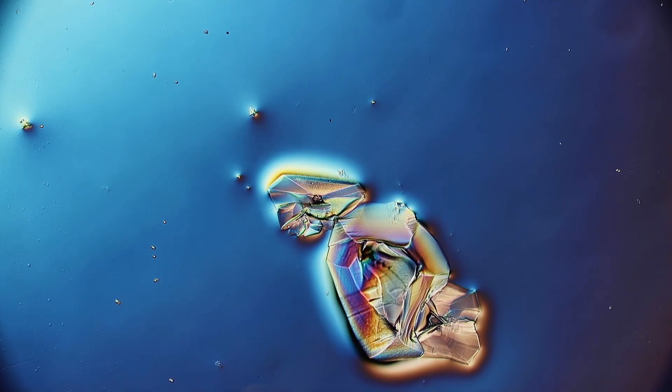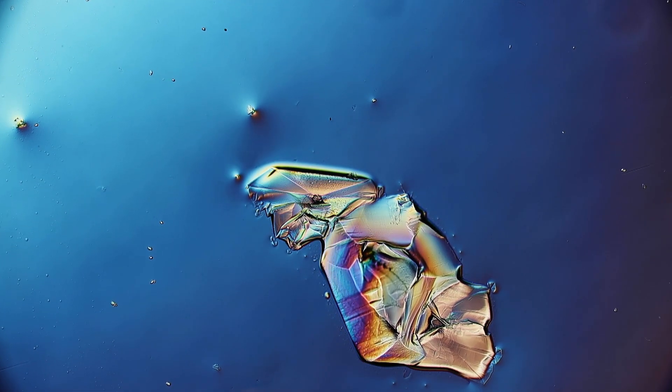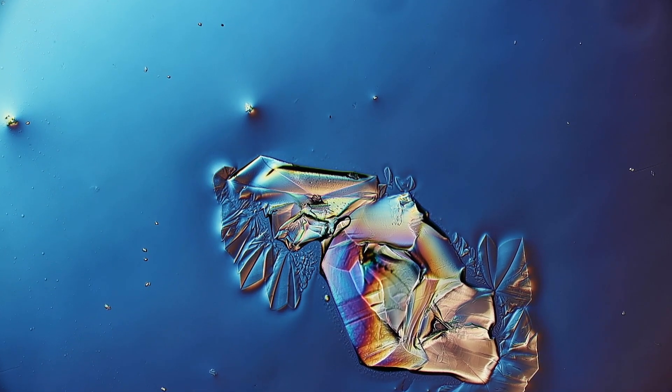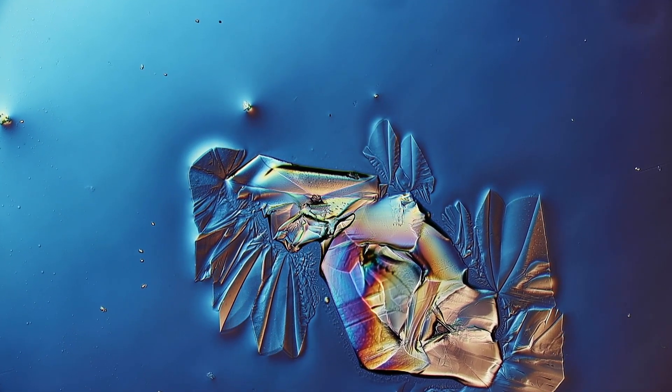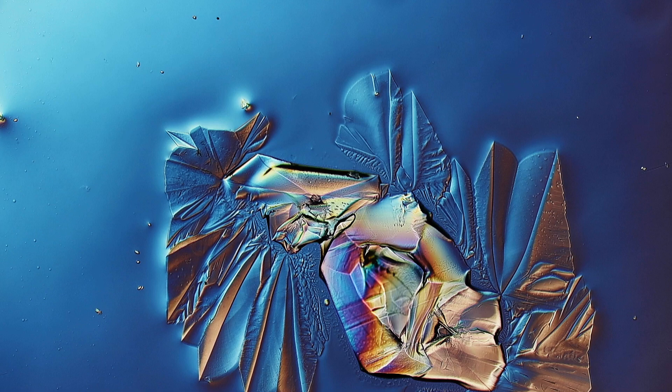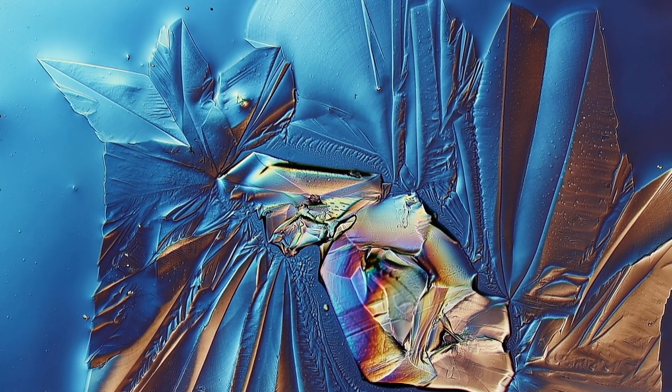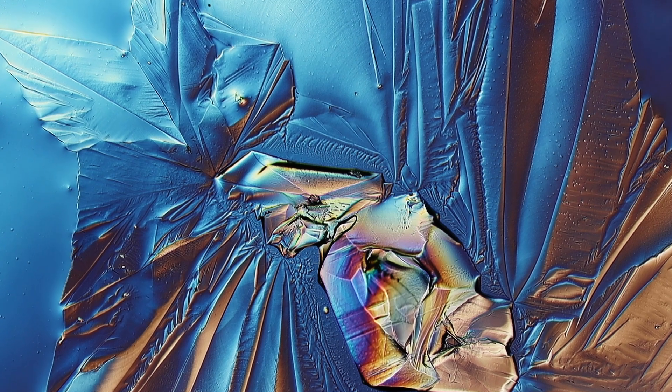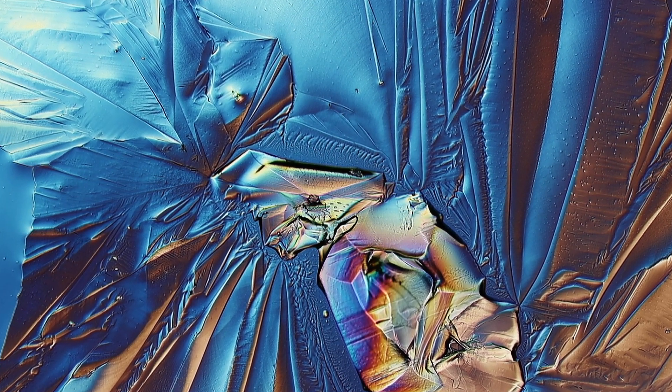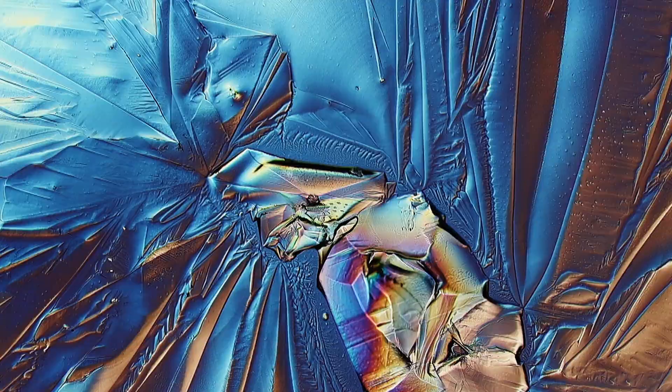It's because of a difference of a refractive index and because of the evaporating alcohol. In any case, the crystals they start to become smaller and the alcohol evaporates, and then when the alcohol is evaporated, then the citric acid starts to recrystallize in the form of very thin layers on the microscope slide. And what I've done here is I've now caught this under the microscope and I've made a time-lapse video here. So what you see here is 10 times faster than in real life, and I think it really looks beautiful. As you can see, as the citric acid starts to spread across the slide and starts to recrystallize, you see all of those beautiful colors.